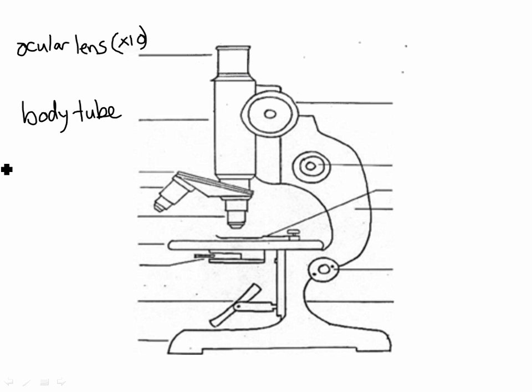I believe this one's called the revolving nose piece. Uh-oh, my spelling is terrible and is going to come into play. The revolving nose piece contains the objective lenses, and it allows us to switch between various magnifications. The shortest lens is the weakest. It tends to be ×4, and it's written on the side. The next shortest is the medium power objective lens. It tends to be ×10.